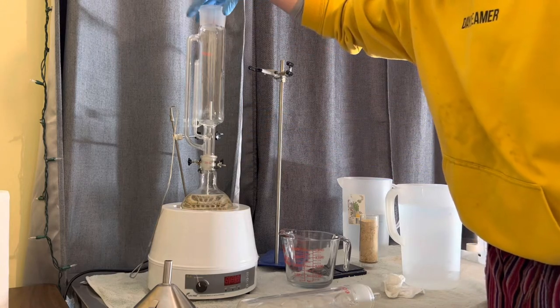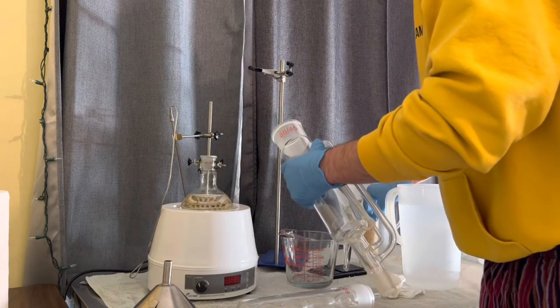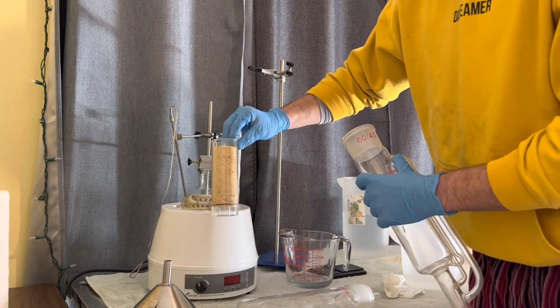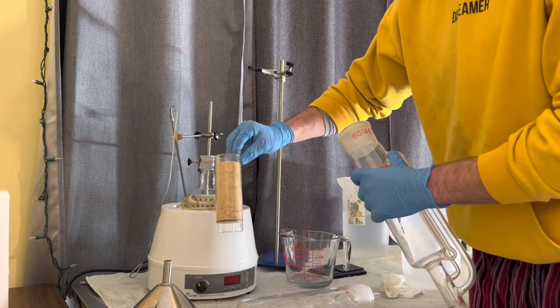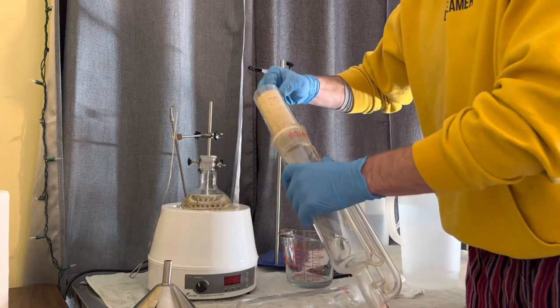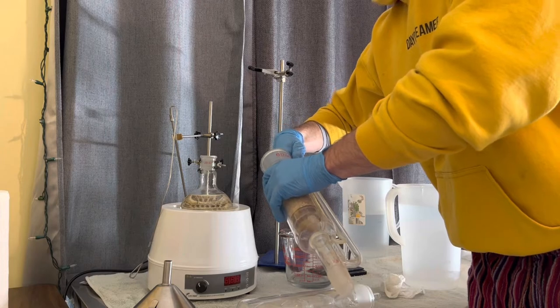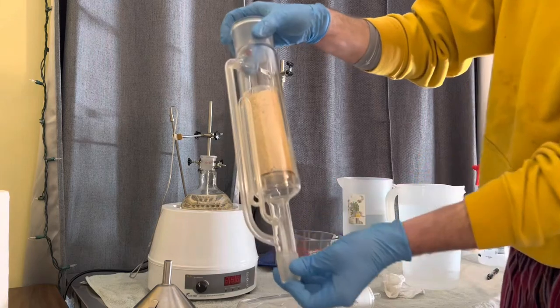And we have our main chamber here. In this main chamber is really where all the action happens. This piece right here is your thimble. This is what you put your mushrooms into, or spices, or whatever it is you're extracting, your plant material, organic matter. And carefully slide it into here. These thimbles are a pain in the butt to try to find. They're not cheap, and they are glass. So you want to be gentle with it. Get it in there.